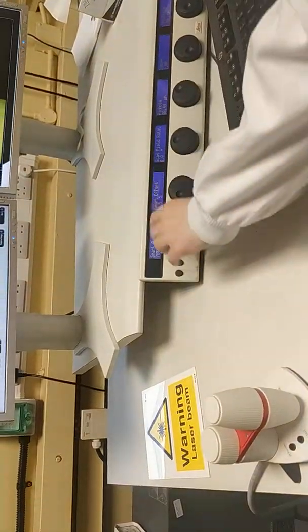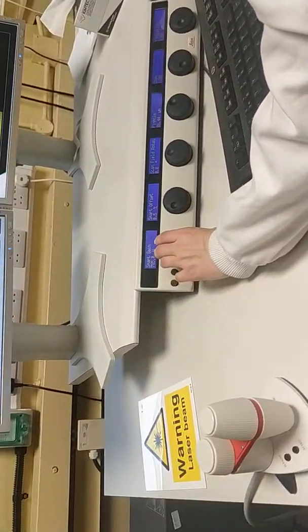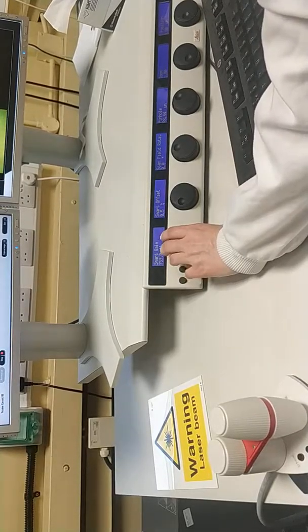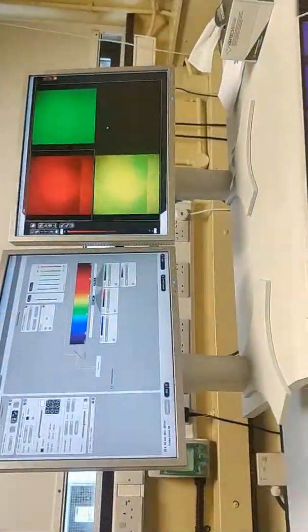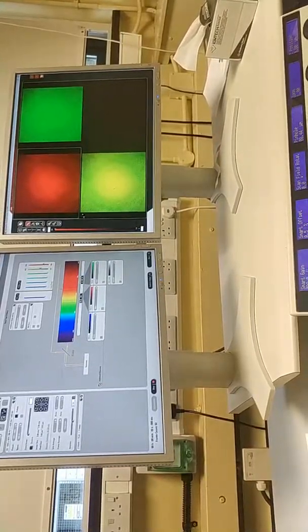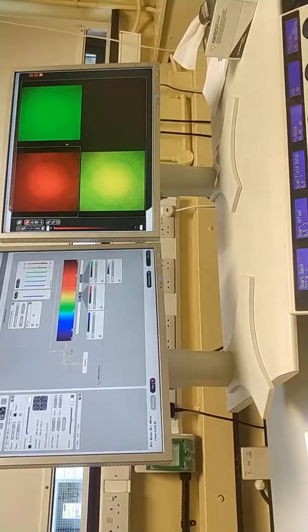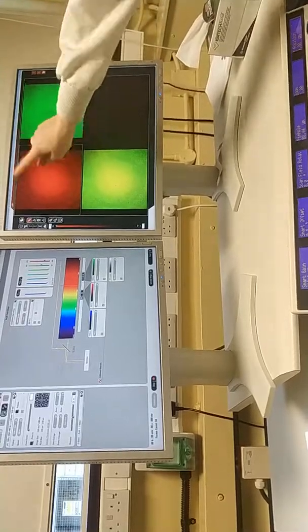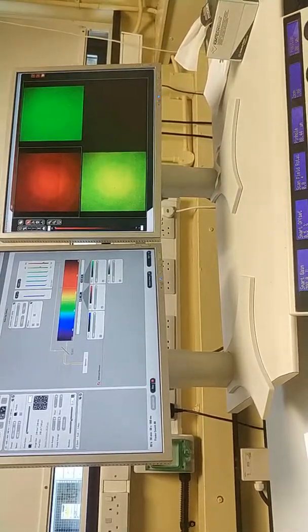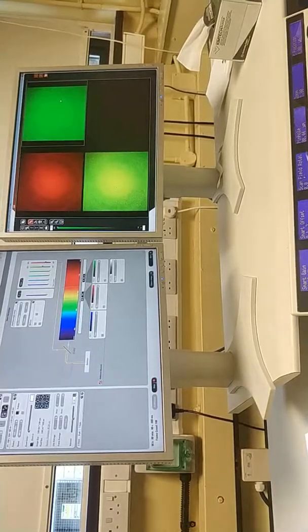Okay. So then I would go with a lower gain in this case, because the values of the power are the normal ones. And also, if you see that here we have a white square, we are only decreasing the gain in this one. If you want to decrease the gain in the other channel, then you have to press.